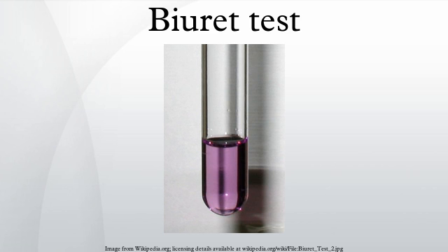High-sensitivity variants of the Biuret test: two major modifications of the Biuret test are commonly applied in modern colorimetric analysis of peptides: the bicinchoninic acid assay and the Lowry assay. In these tests, the Cu+ formed during the Biuret reaction reacts further with other reagents, leading to a deeper color. In the BCA test, Cu+ forms a deep purple complex with bicinchoninic acid, which allows proteins in the range of 0.0005 to 2 mg per milliliter to be determined.